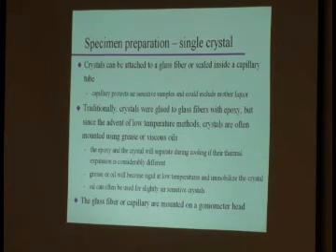Of course I had to try that out. It works beautifully if you have a small crystal, okay? If your crystal is 200 micron, it might get tough. If your crystal is 50 micron, not a problem. And it makes sure you don't have too much grease on that glass fiber, okay? Because you really can't see the grease that you have on the glass fiber. That's how little you need in most cases. So, that's how we usually mount them.